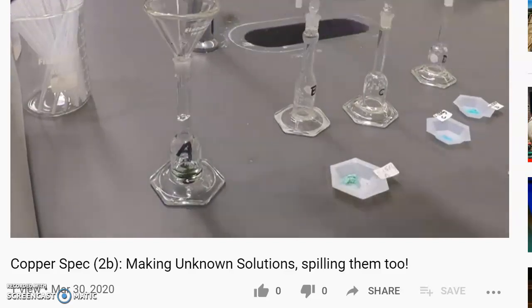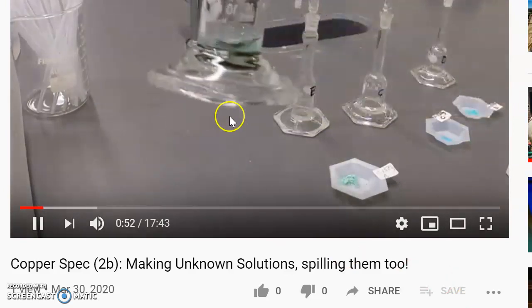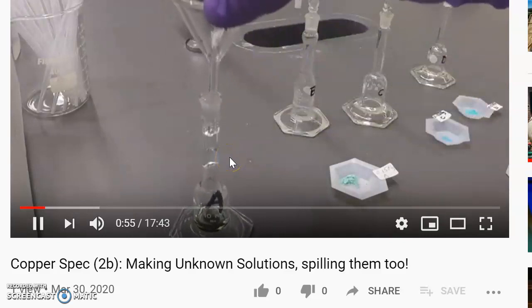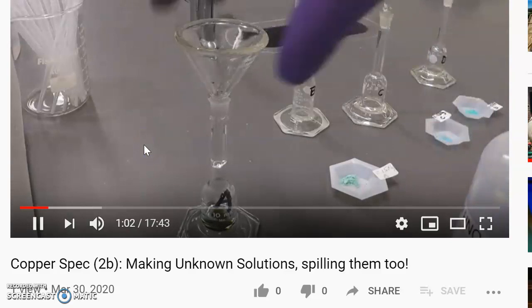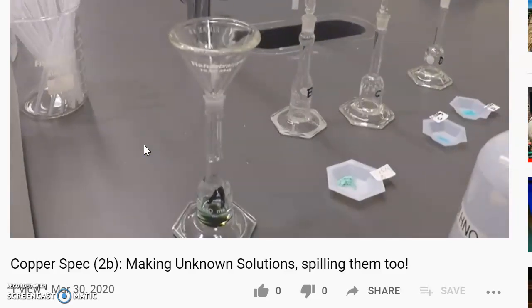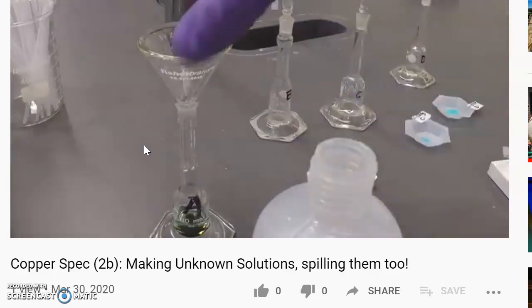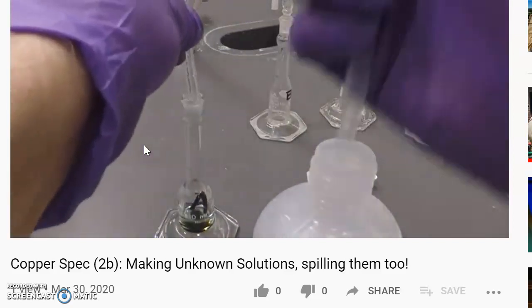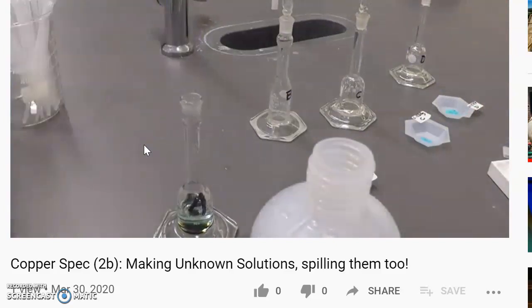And making a solution, so all 4 of these will be made the same way. Put nitric acid in our flask and we will bring that up to the line and mix it well. The same thing that we did with the standard samples, we are going to do with the unknown samples. So we're going to mix these up and put them into cuvettes and then record the absorbance from the spectrophotometer.